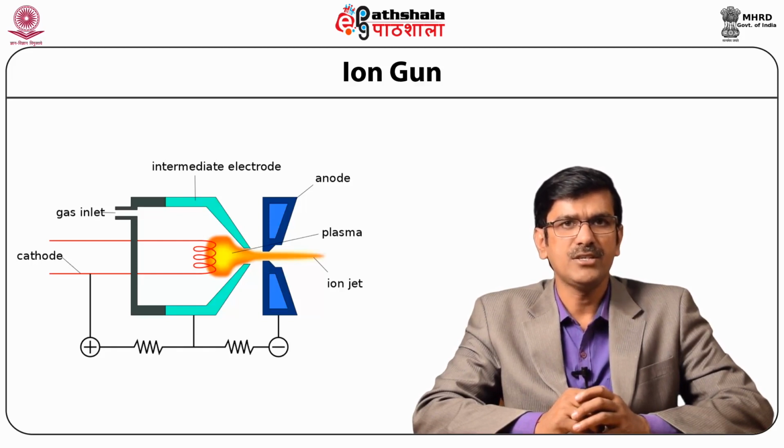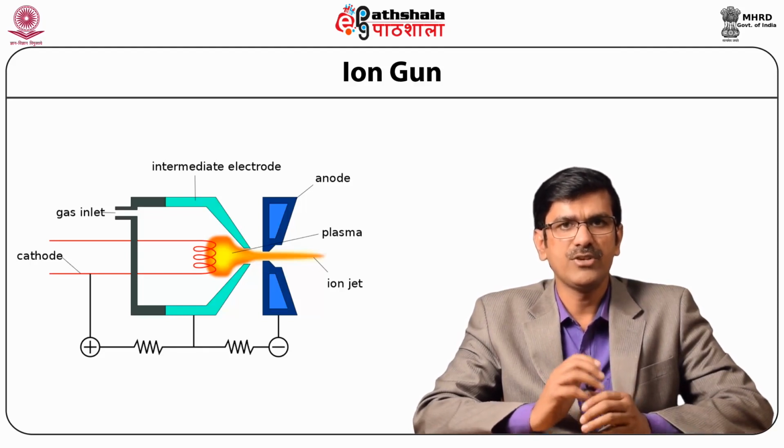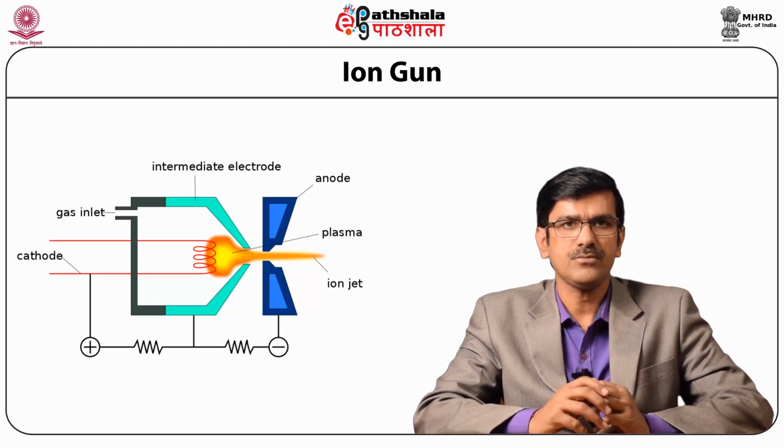The efficiency of the ion gun depends on many parameters such as the gas pressure used, filament current intensity, and the etched surface. The ion beam is extracted from dense plasma which produces a magnetically constricted arc. The ion beam is focused and rastered over the specimen by a set of deflector plates. Credit for high etching rates can be given to the source due to achieving high current density.